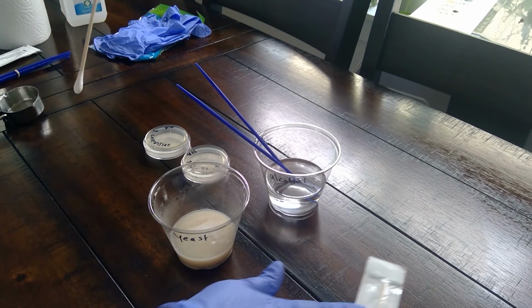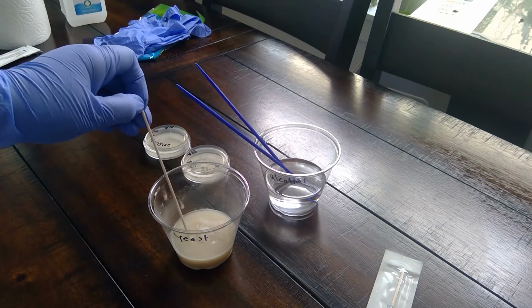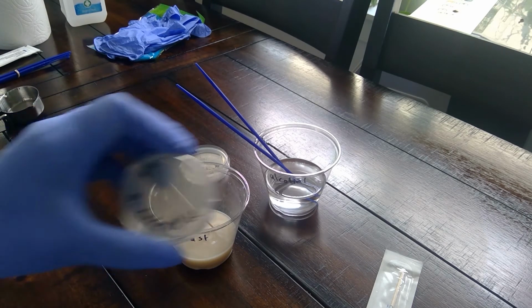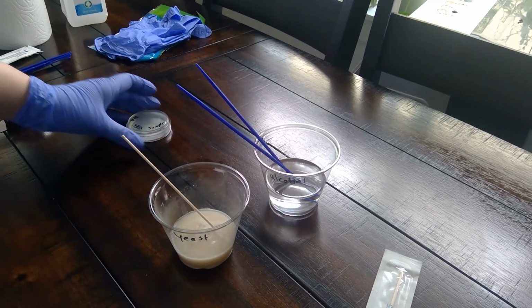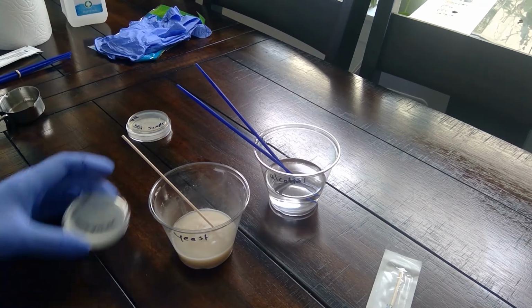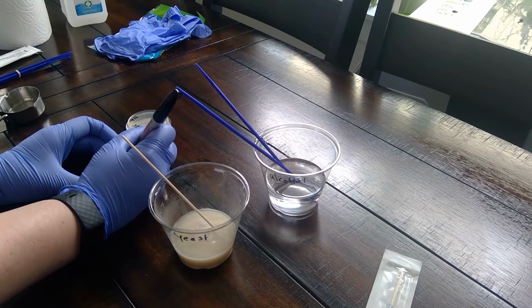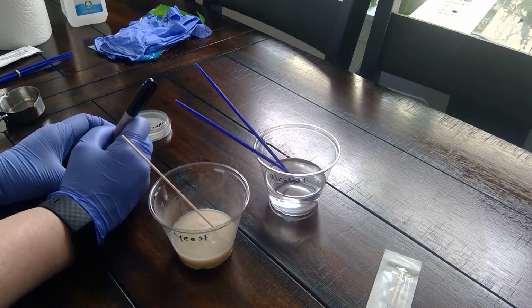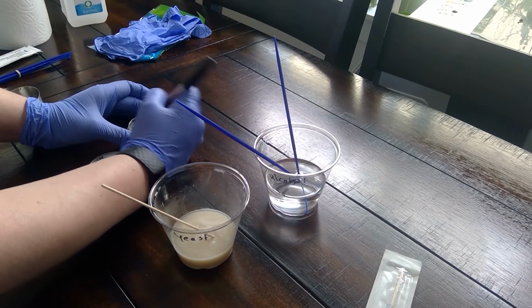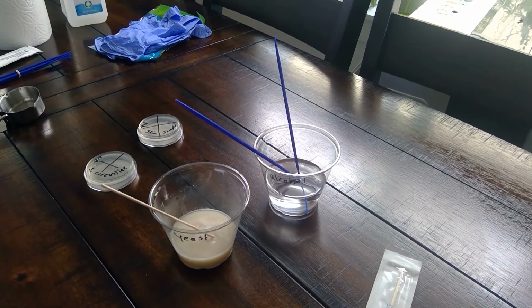And that'll keep this one sterile, and we'll just submerge it. And then it says immediately transfer the yeast mixture, saturating the swab, into one quadrant of the agar plate labeled S. cerevisiae. So we're going to be using this one. It doesn't say so, but since these are so small, I'm going to draw my quadrants so I have an idea of what 1/4 of the plate looks like.